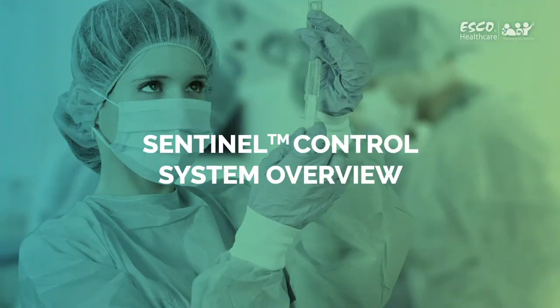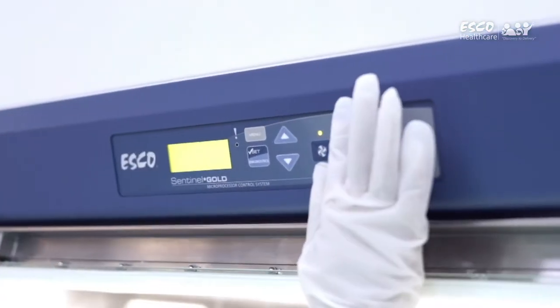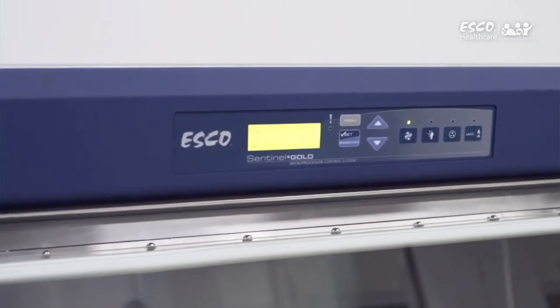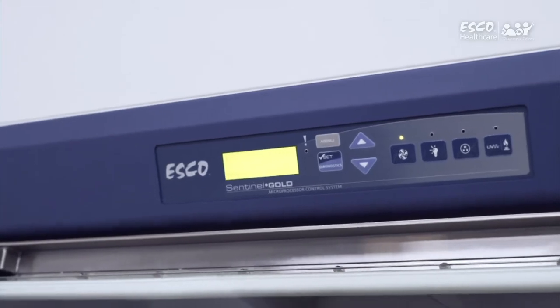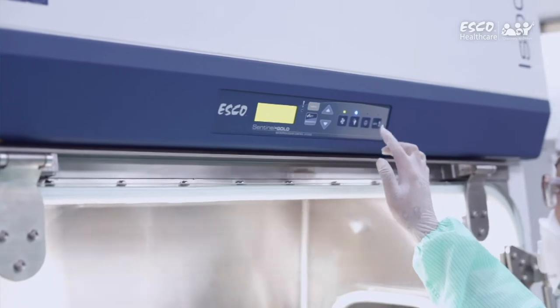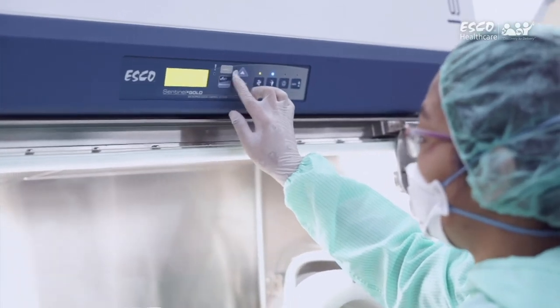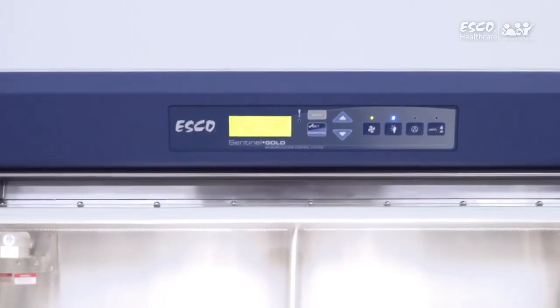Sentinel Control System Overview. Before we start using the HPI, let us first get to know the Sentinel Gold Control System. The Sentinel Gold Control System is the user-friendly, easy-to-operate and easy-to-access microprocessor controller of the HPI. It is located at the center of the isolator unit and is angled down for easy viewing from both sitting and standing positions. The system also utilizes a four-digit security pin, which ensures that only authorized personnel are permitted to work in the unit.